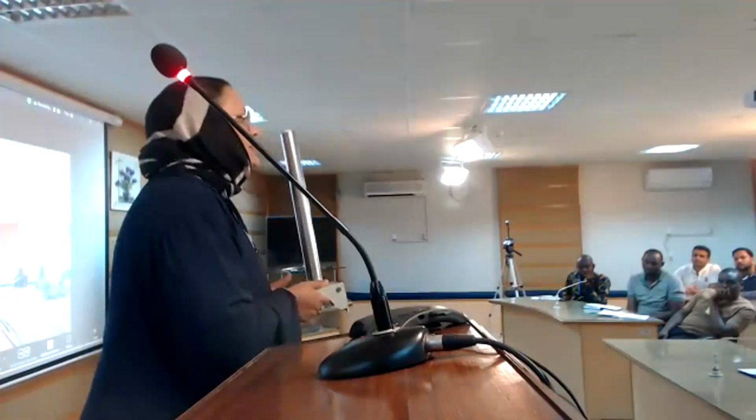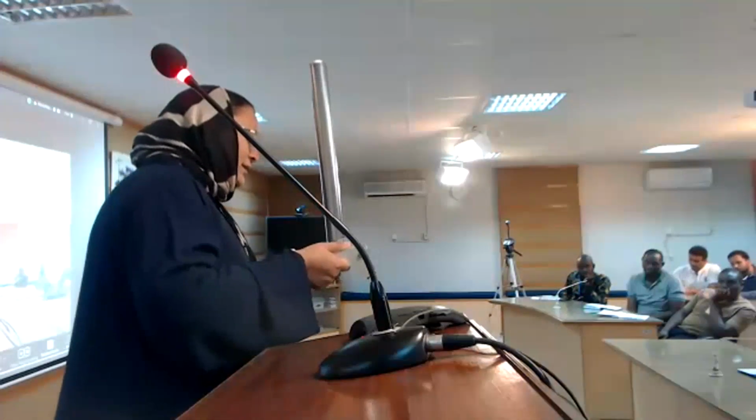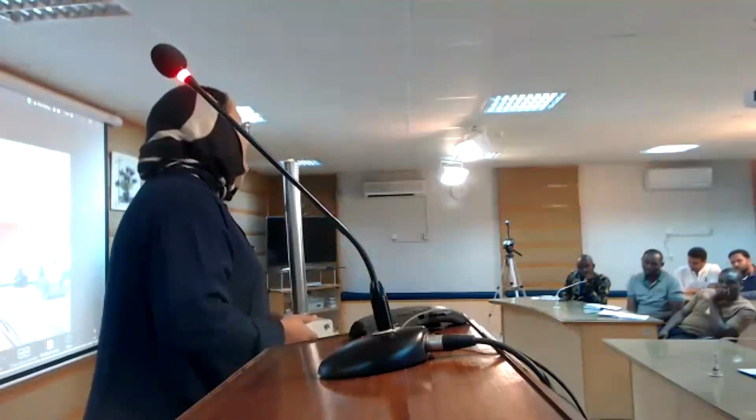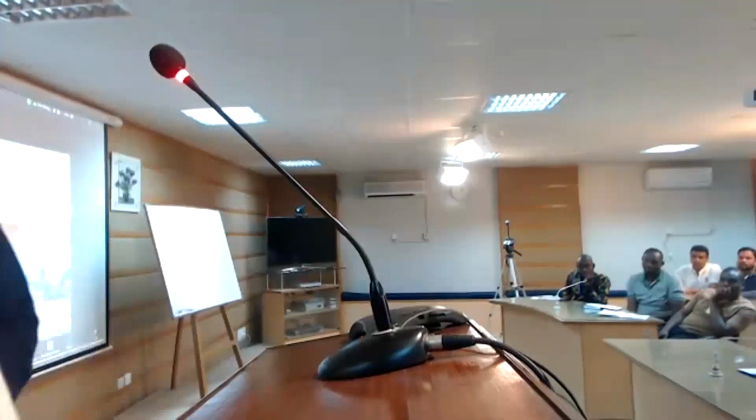Everything that we are talking about is present here in this small probe, so it's very expensive. When you visit an NMR lab, you will see that in all magnets there is a probe at the bottom. And this is the NMR tube that goes and sits inside here.